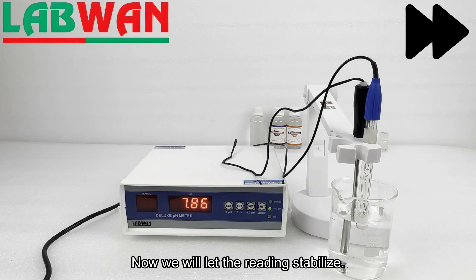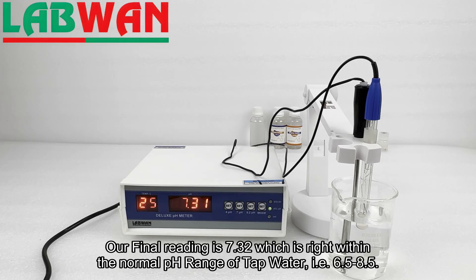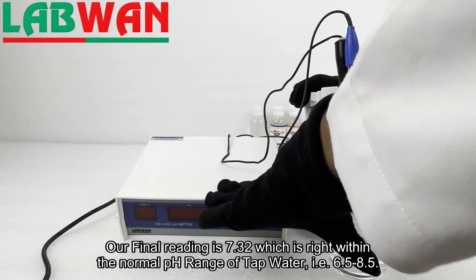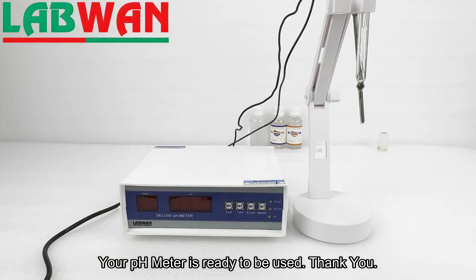Now we will let the reading stabilize. Our final reading is 7.32, which is correct — within the normal pH range of tap water, that is 6.5 to 8.5. Your pH meter is ready to be used.